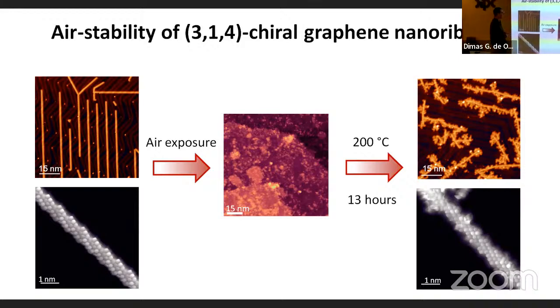And in fact, when you take the high resolution images, you see that many of these hexagons are distorted, they change in brightness. So all of these are associated to chemical changes. So these ribbons have degraded when going from here to here. And obviously the electronic properties have degraded as well. Okay, now the question is, what has driven this degradation? Because we have exposed them to air, but we have also annealed this sample, and we have annealed them in the presence of all kinds of molecules next to them. So we may just be activating some reactions of this crap that is co-adsorbed with the ribbons.